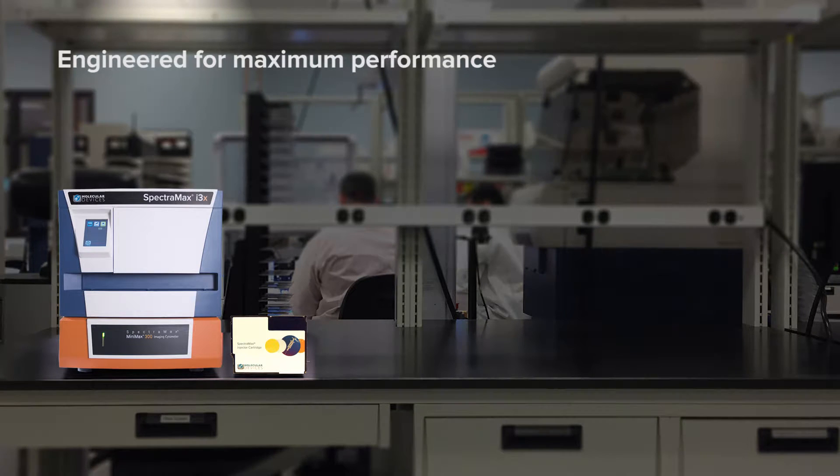Engineered for maximum performance, the SpectraMax injector cartridge features smart inject technology for simultaneous injection and mixing to ensure complete reagent incorporation.